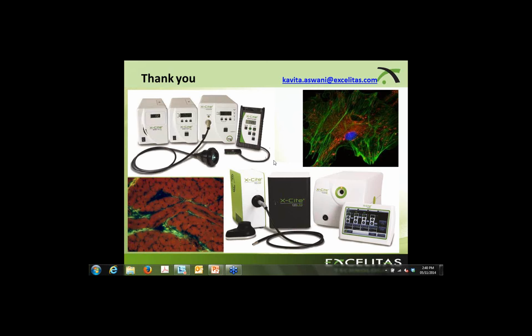I will tell you that within like the 540 to 570, LEDs will not be as bright as lamps, but at the red or at the blue, depending on which spectrum you're looking at, it really varies. And I always have trouble answering that one without showing graphs.